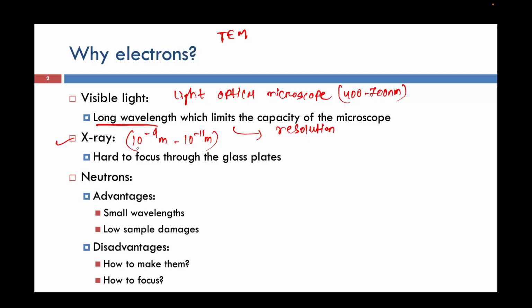If you want to get any kind of information, why is it hard? Because of the absorption coefficient and the absorption nature of the X-ray. When a specimen, let's say this is a sample, meets an incident X-ray, a large portion of the X-ray gets absorbed by the sample, and a very small portion is either transmitted or scattered.